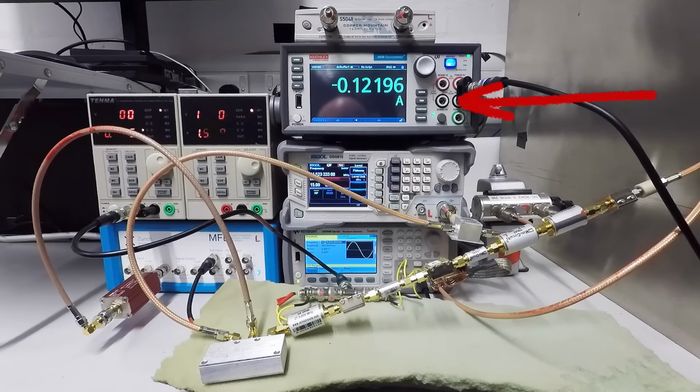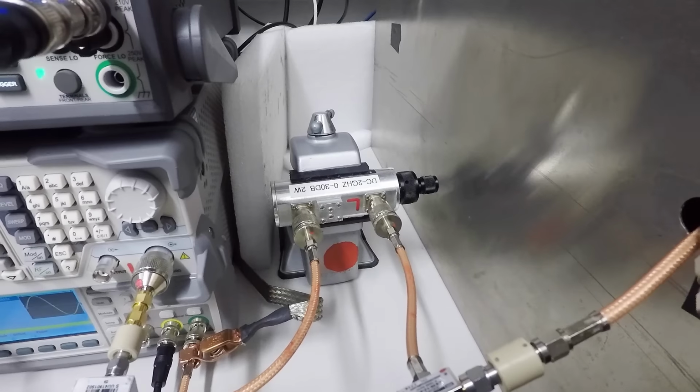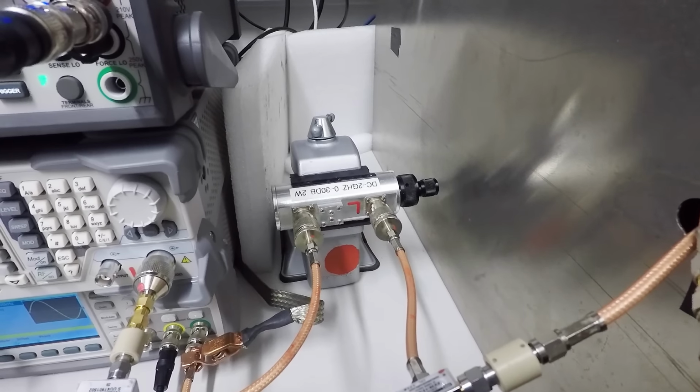On the right, the large green display, that's our DC power supply, remote controlled to adjust the Helmholtz coil setup. Our signal generator just below the DC supply. And finally on the bottom there is our waveform generator, which drives our modulation coils. And lurking just at the back there we have our variable attenuator.